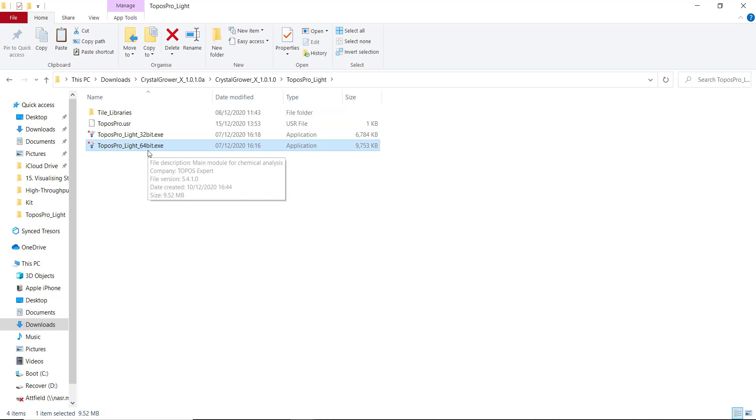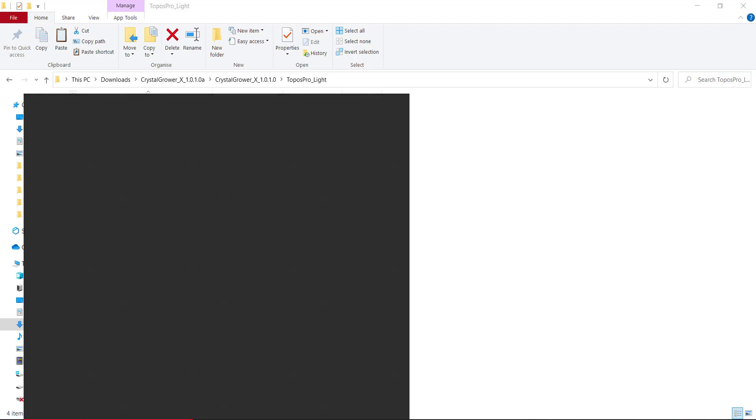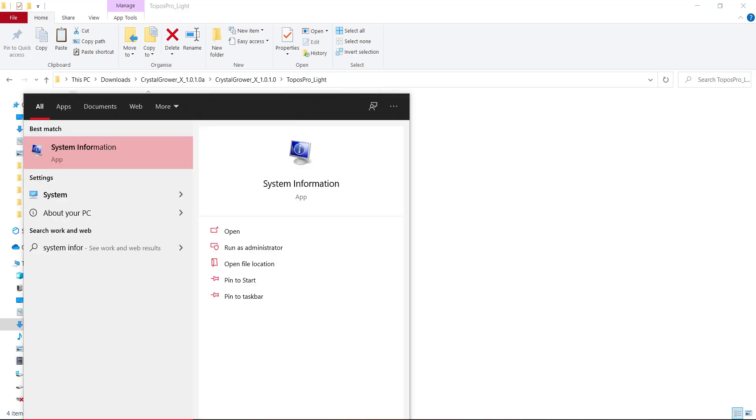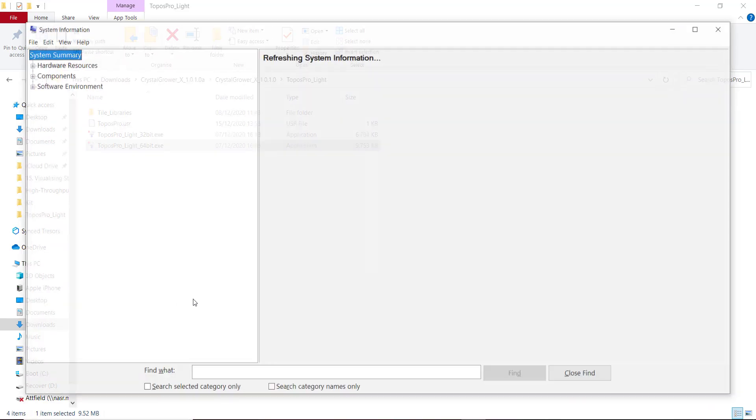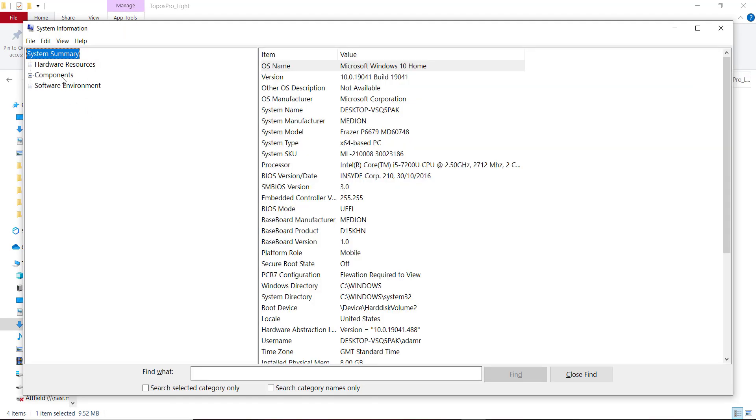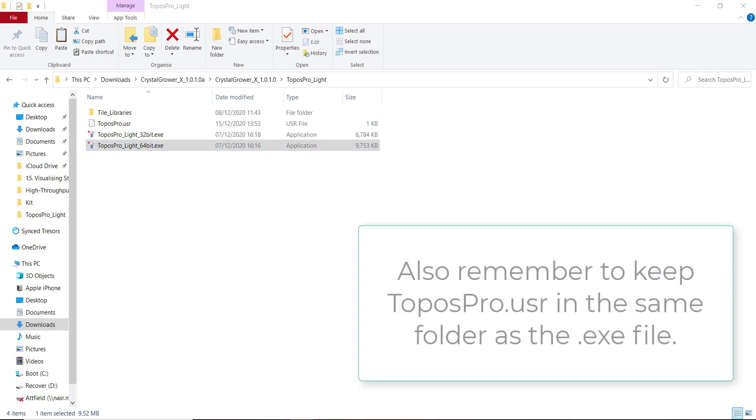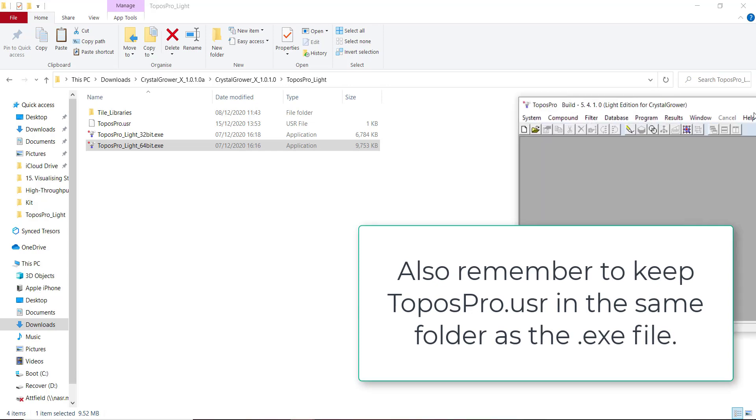I'll just go through the process of setting up ToposPro. I have a 64-bit operating system. You can find yours out if you look in System Information on your computer. You'll see mine here says X64-based PC. I can just open this one here, or I can move it somewhere else on my PC for easier access. But make sure you don't delete this Tile Libraries folder when you do this.